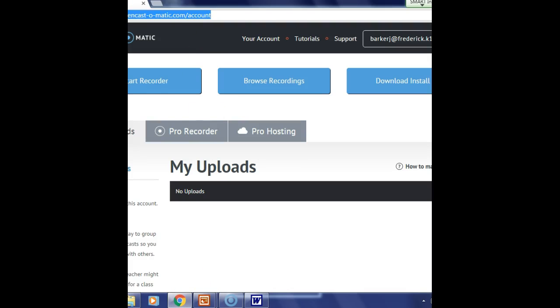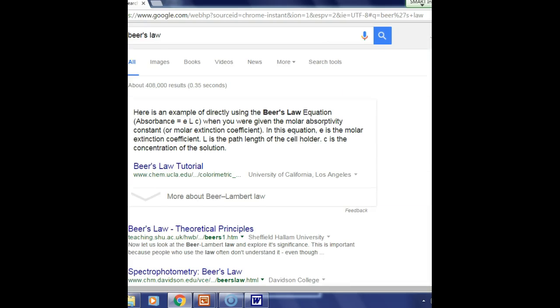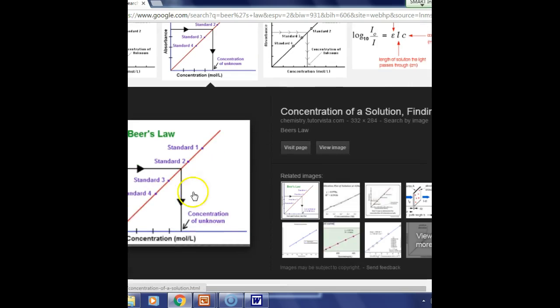Again, for the best fit line, the b is hopefully going to be close to 0. But just to remind you from before when we covered Beer's Law, trying to see if I can find the graph that'll look like it. Basically, we're taking different concentrations, and as the concentrations increase, so does the absorbance. Sorry, that's not all completely in your window.